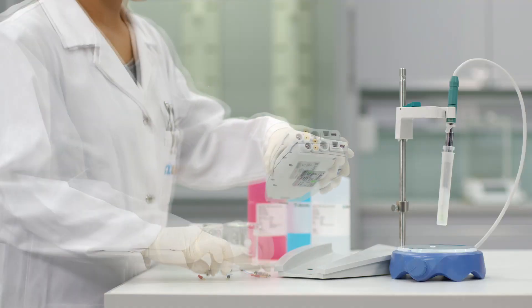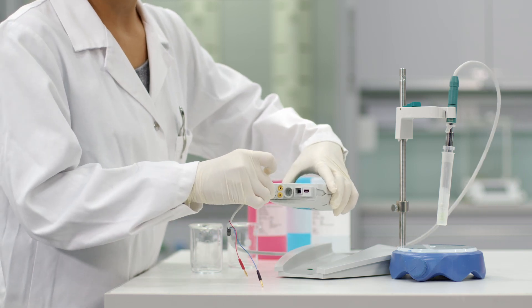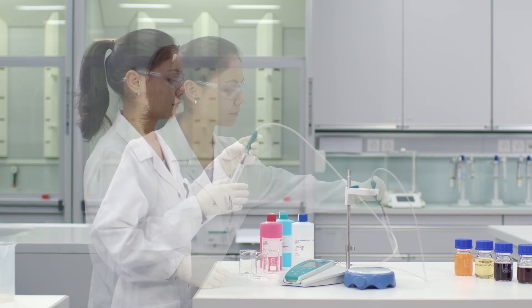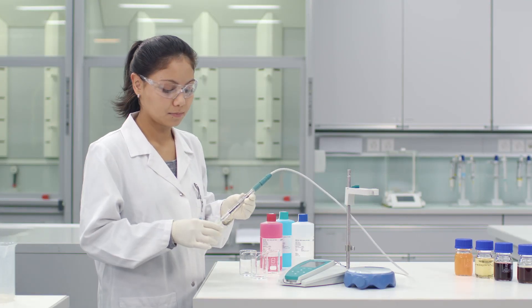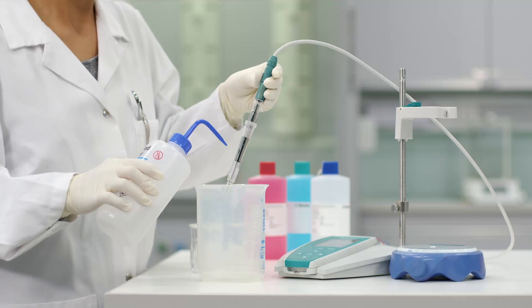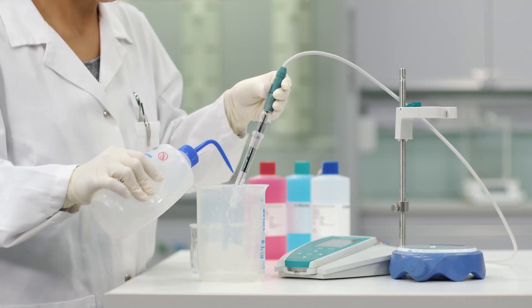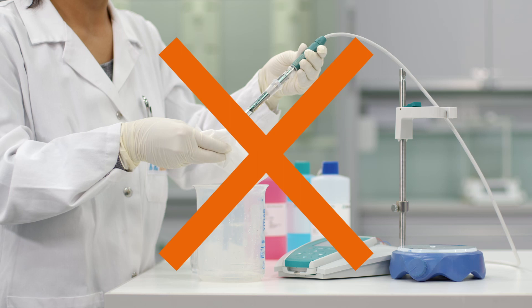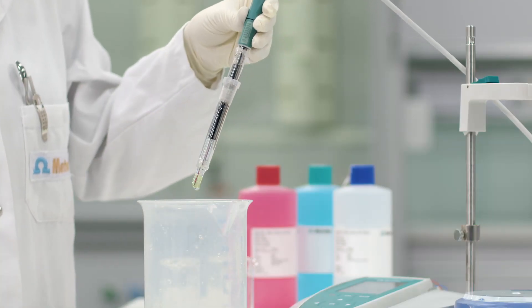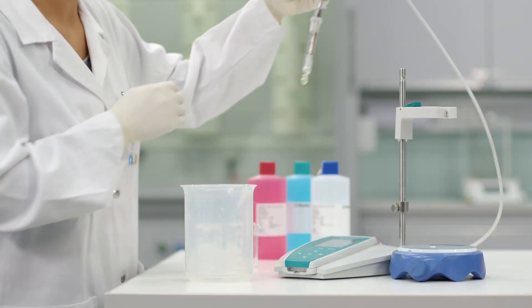Before you start, make sure your pH electrode is connected to your meter. Take the electrode out of the storage vessel. If necessary, refill the electrolyte. As a rule of thumb, the level of the electrolyte should always be higher than the level of the sample solution. Rinse the electrode well with deionized water. Do not dab-dry the electrode with a tissue, as this can damage the electrode. Shake off any remaining water drops by shortly moving the electrode back and forth.